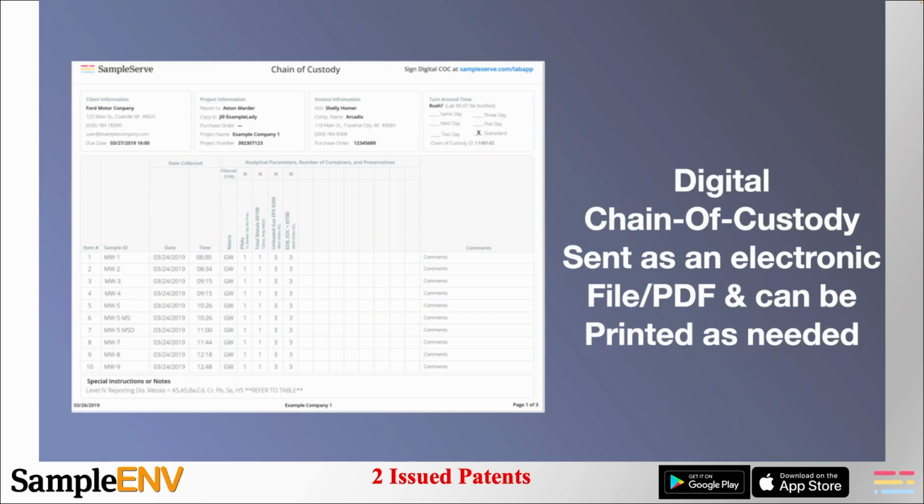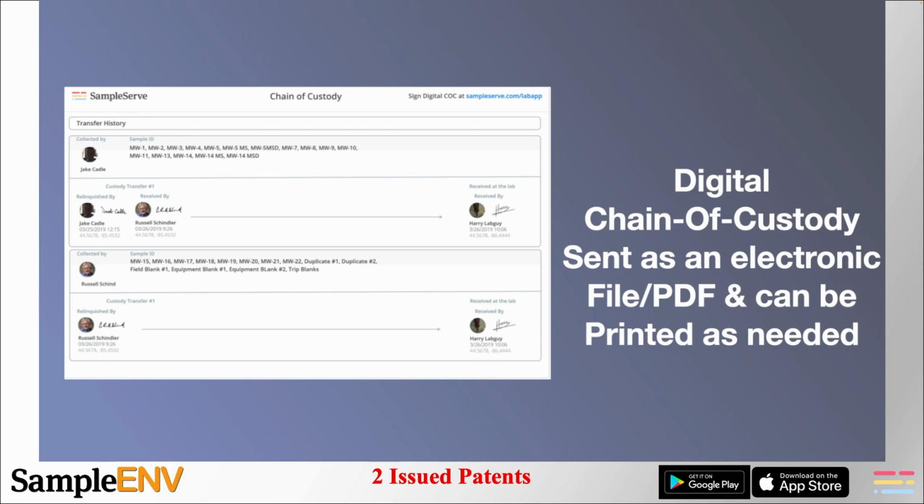It's got all the billing information, turnaround time, project information. It's got all the analytical parameters that you want tested, the number of bottles, date, and timestamp, all filled out automatically in milliseconds. The bottom gets a little bit different than a traditional chain.